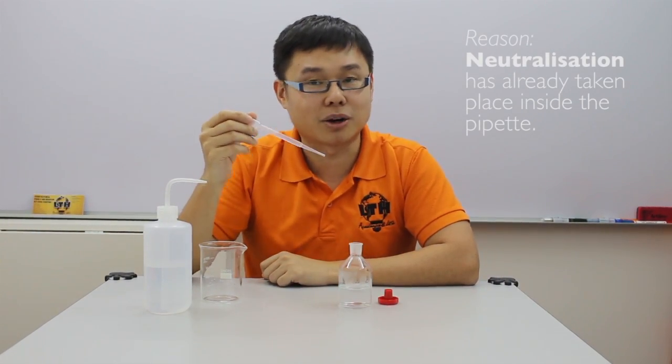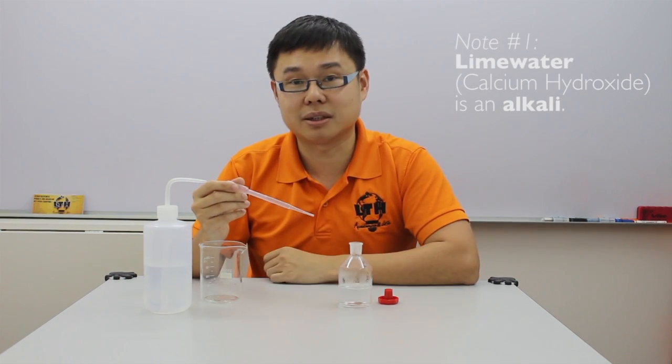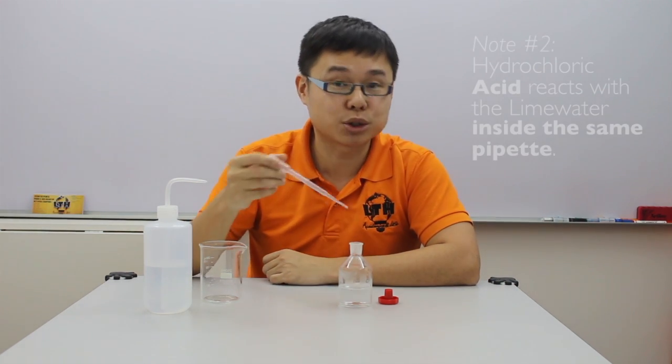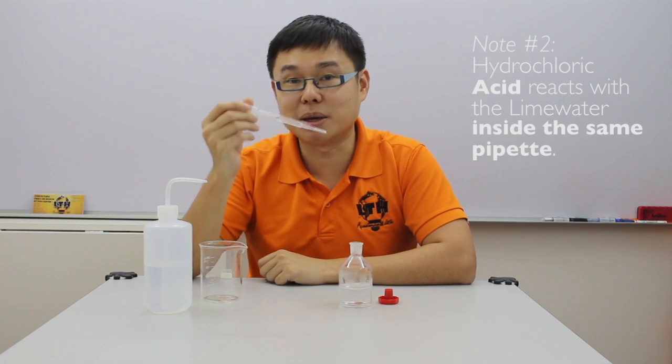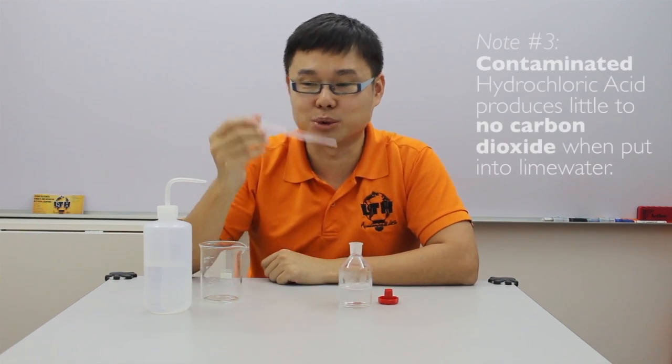This is because when they first used the pipette to extract lime water, lime water being calcium hydroxide is actually an alkaline. When they use the same pipette to extract hydrochloric acid, these two chemicals will react within the pipette, causing neutralization.